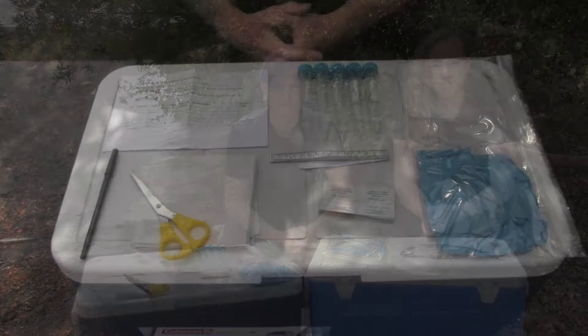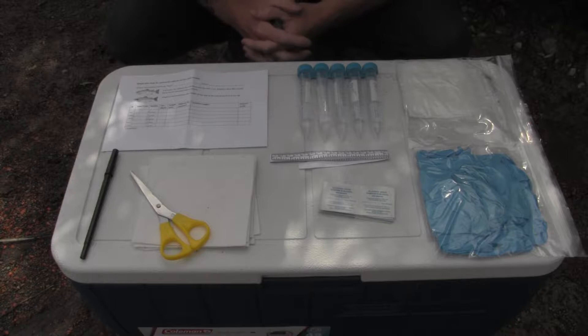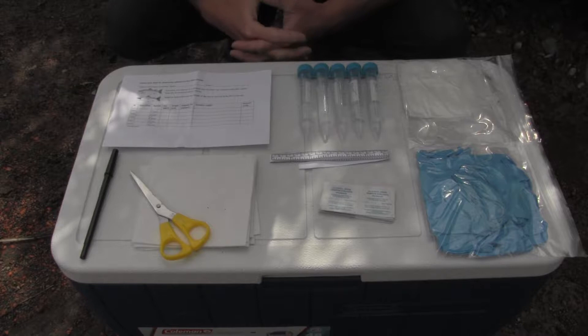This is the contents of one of our DNA sampling kits. There are two main components: this datasheet where you'll record information about each sample, and on the back it has written instructions for sampling; and the DNA preservation tubes. Each tube contains a volume of a preservative. This preservative isn't harmful, but it can be a bit of an irritant.